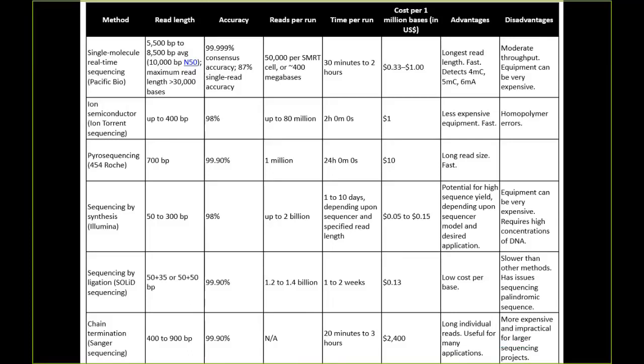So they want to verify some part of a plasmid. They want to sequence one specific part of one specific gene. So this is very good for targeted sequencing. Also, because now it's been outsourced to a lot of labs, typically you just send off a sample and you pay like $5 to $8, and you get back data the next day.